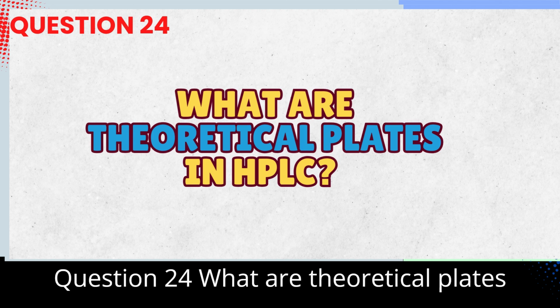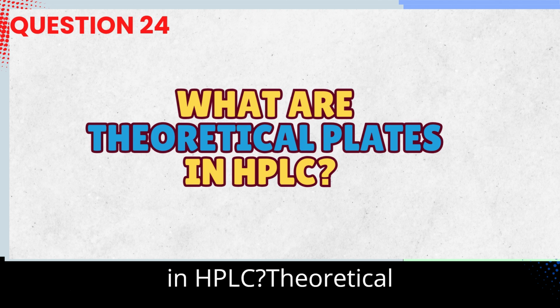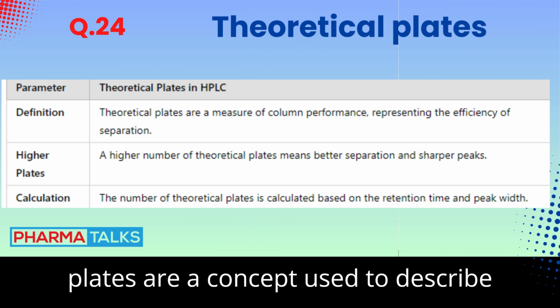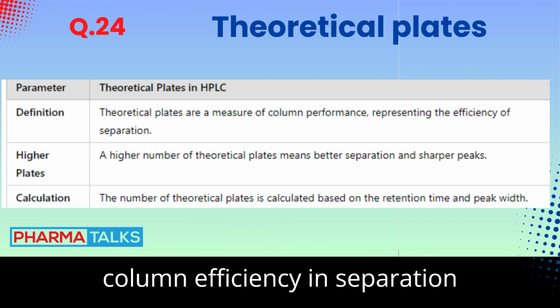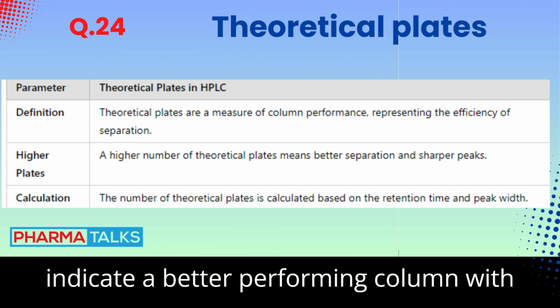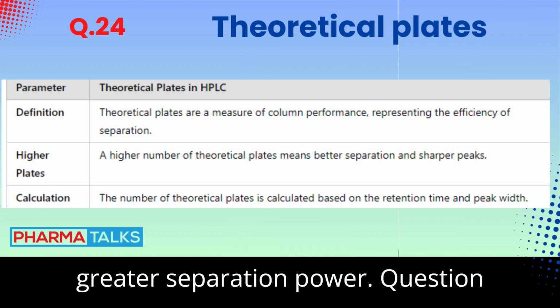Question 24. What are theoretical plates in HPLC? Answer. Theoretical plates are a concept used to describe column efficiency in separation processes. More theoretical plates indicate a better performing column with greater separation power.